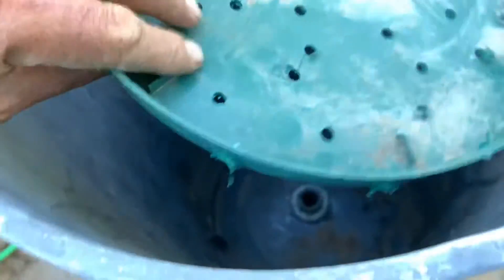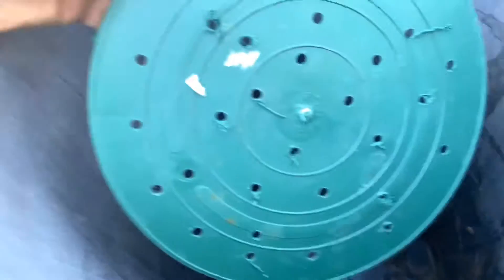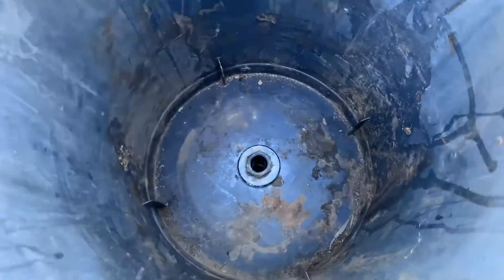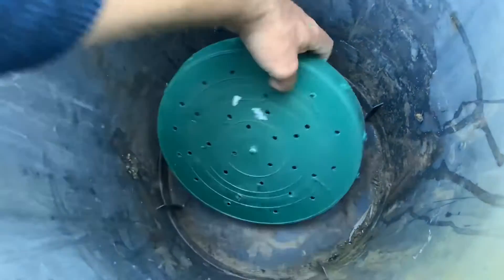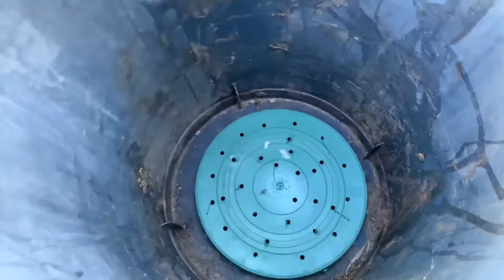Down inside here I'm going to use a pan — a hot plant pan. I've just drilled some holes in it and that's going to protect the flange so it doesn't get blocked up. Just drop that down the side, which is good to go.